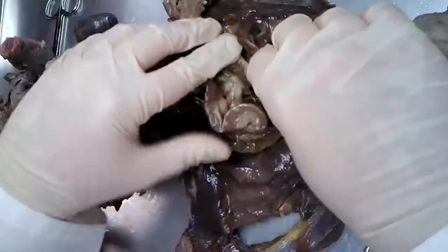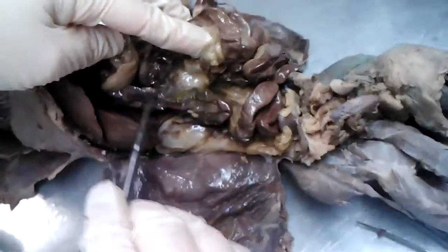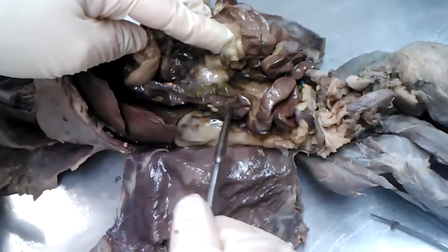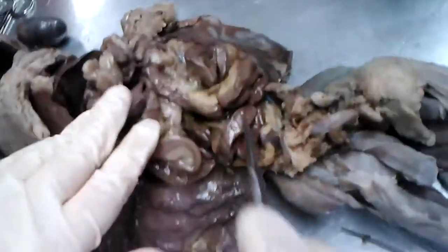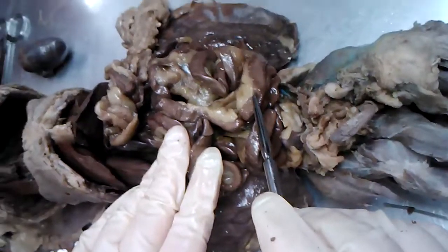And going down the right-hand side of the small intestines, right in here, this is the duodenum. Put everything back in place. We then said these upper loops would be jejunum, lower loops are ileum.